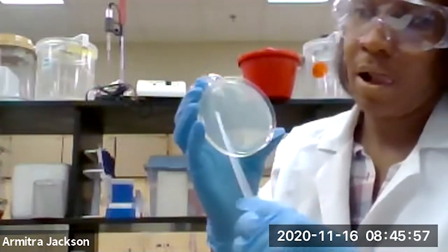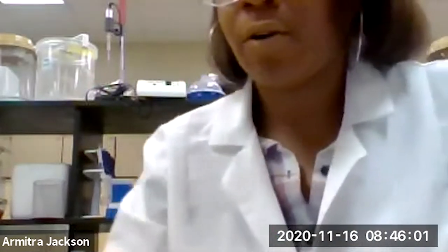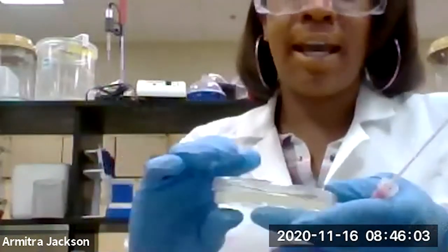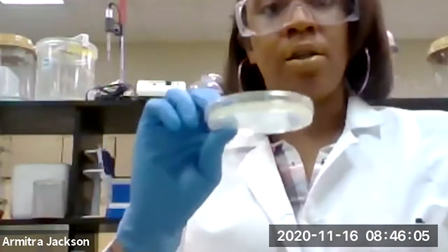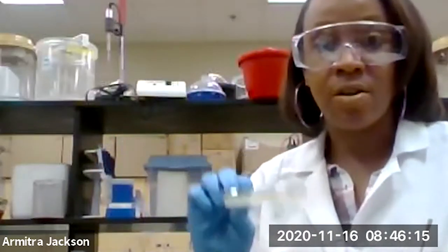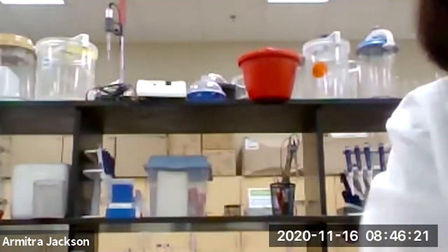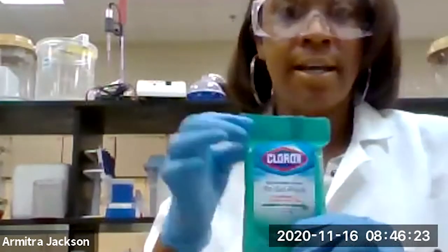Then we are going to cap it. Be sure that you label this really well, because we're going to take a Clorox wipe and clean that area and then swab again to demonstrate the effectiveness of using a sanitizer. Be sure that you label this really well.